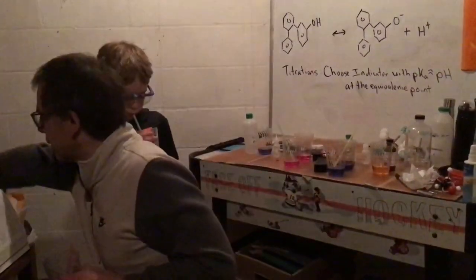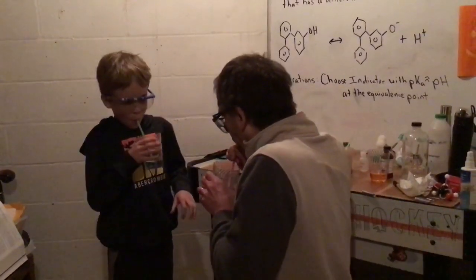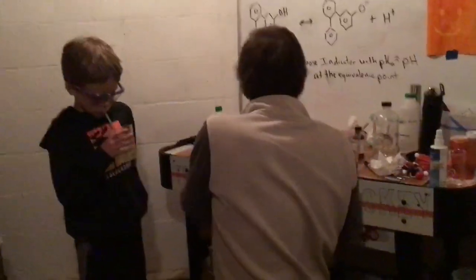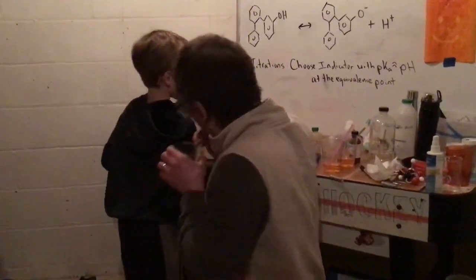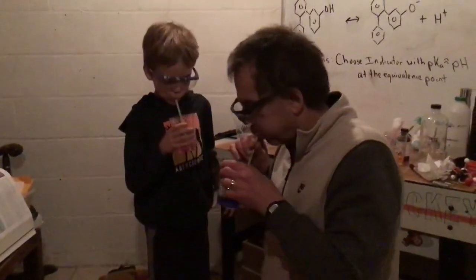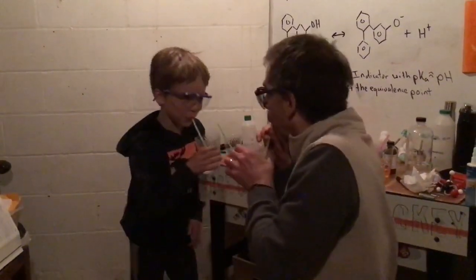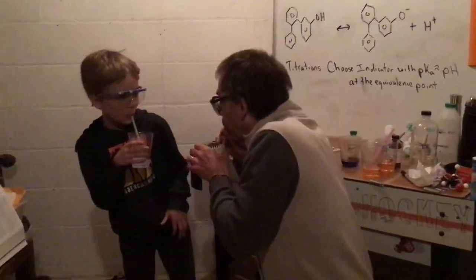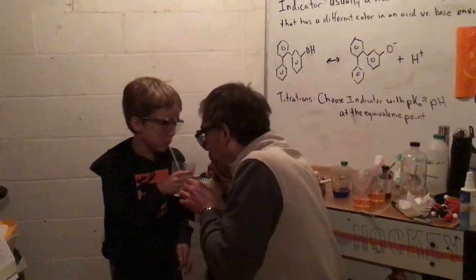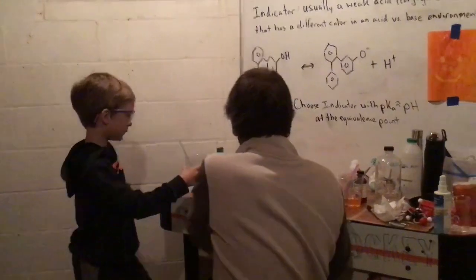I'm going to need my safety glasses. Okay, we'll stop.